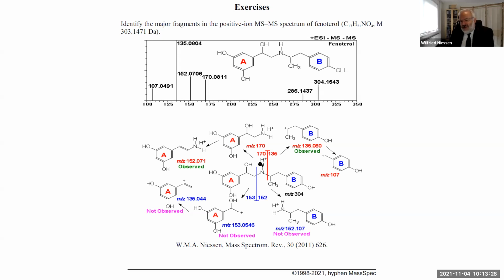If properly calibrated, current instrumentation allows you to get accurate mass values with the error in the third decimal place or better. And that means that with values like that, typically you have a mass accuracy better than 3 millidalton. And then if you start working out from a known structure, you get a limited number of possible elemental compositions.